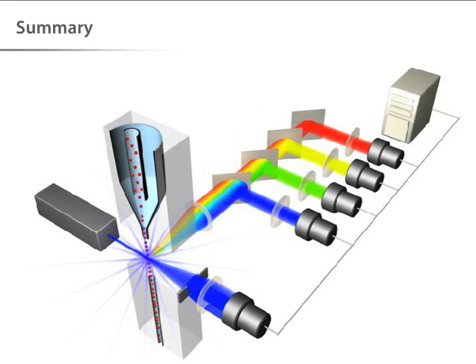In summary, flow cytometry is a unique tool, providing scientists with a way to gather statistical data on large numbers of cells and use that information to correlate multiple parameters within a cell population. 4 to 6 color experiments are becoming easier. A few labs in the world are able to distinguish up to 18 colors simultaneously. In the next tutorial, we will talk in more detail about some of the trickier aspects of data analysis that are employed in flow cytometry, especially when 2 or more fluorescent colors are used.